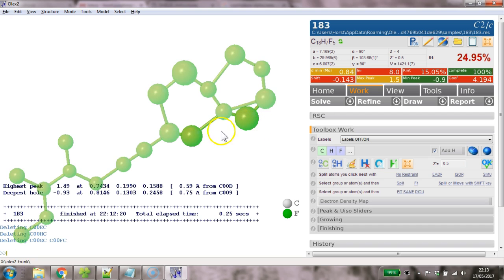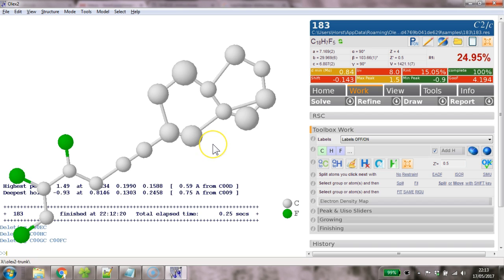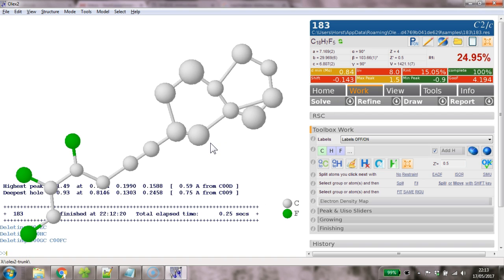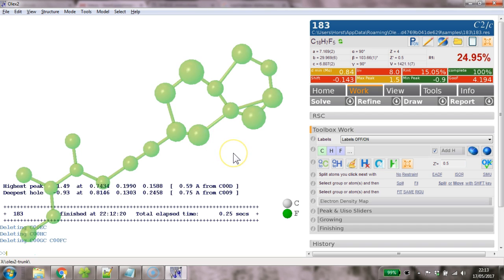And if I double click on this, well, a couple of them are darker than the other. So this means that there is an overlay and Olex didn't remove the ones it should have done. So we go fuse and do 0.1. So now this double should have disappeared. Okay. Now we are starting to see what's going on.